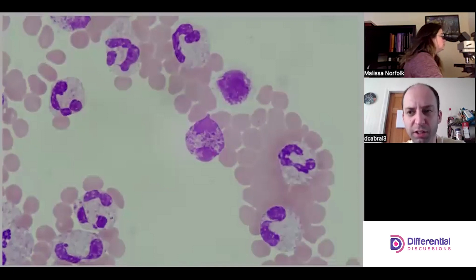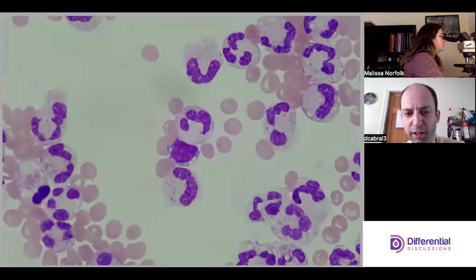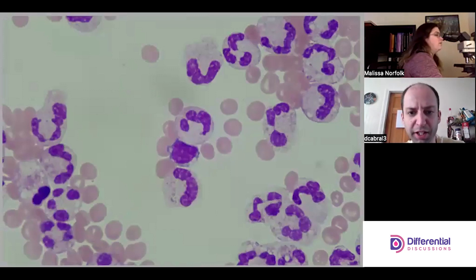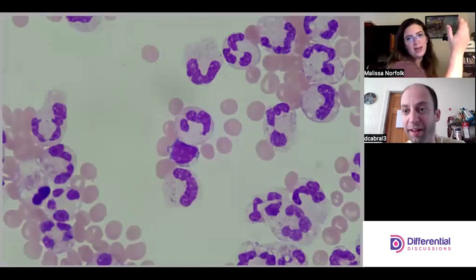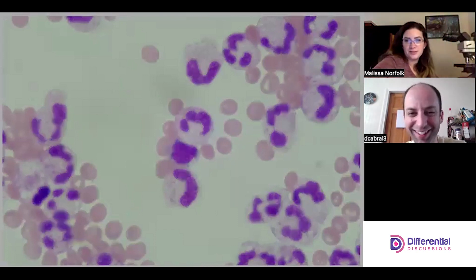I tend to agree — just because of the size of those granules. If we had a counter it'd probably still be just one or two percent; we just happen to come across it. And there's a lymphocyte kind of living over here.